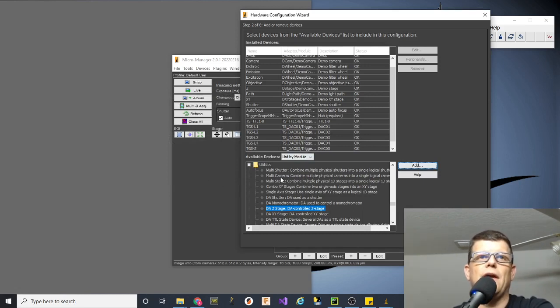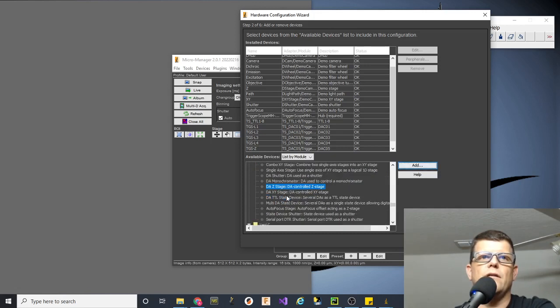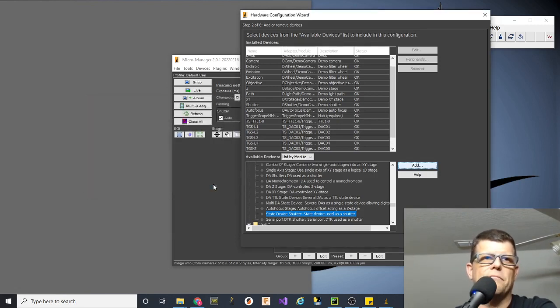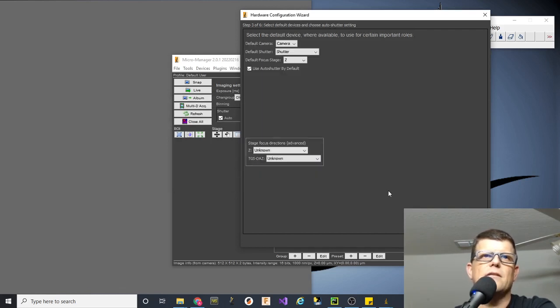Next, we might want to have a, let's see if we can find state device shutter. So what this is going to do is, I don't think we need to assign anything. What this is going to do is set up the TTL output to act as a shutter. All right, so we've got that. I hit next. All right, default camera is camera. Default shutter is going to be my state device shutter. Default focus will be TGS DAZ. Right now, this is just a DA device. We haven't set it up to be connected to the Triggerscope Z yet.